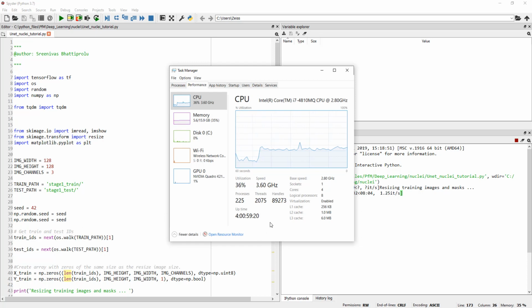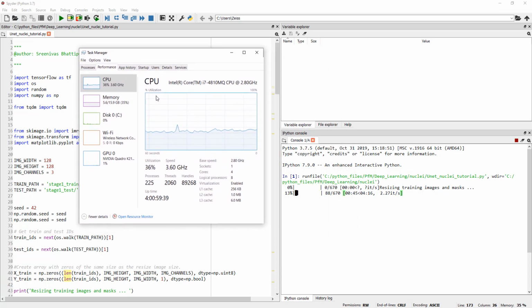Of course, you can write additional lines of code to say, don't use full GPU, use only 30% of the GPU or so. But for now, I'm just going to leave it as is. So this line, import tensorflow as tf, is going to take care of it. If there is a valid GPU like NVIDIA, for example, it's going to use it. If not, it's not. Again, watch my video about how to install or invoke GPU for deep learning.